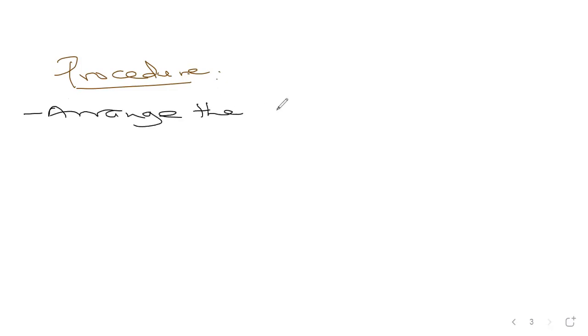What's the procedure of the experiment? We've seen the setup, what we need. We're going to have the procedure. So arrange the apparatus. Dear students, arrange the apparatus as shown above.